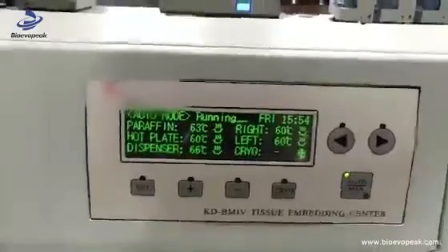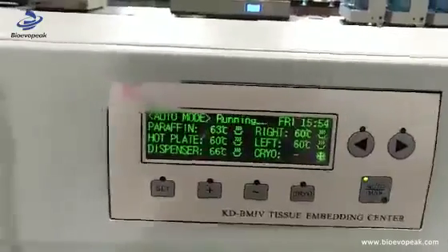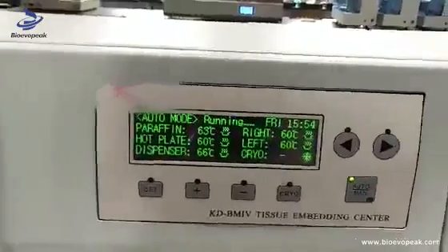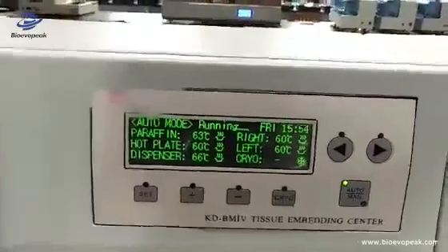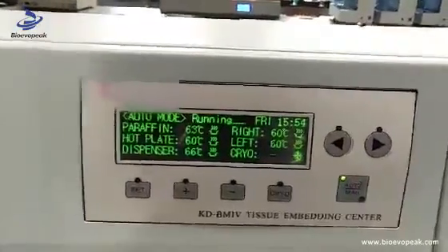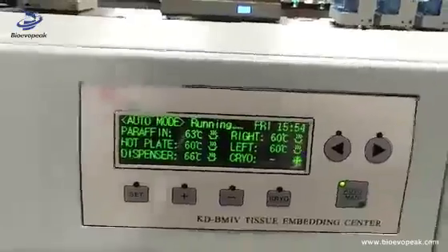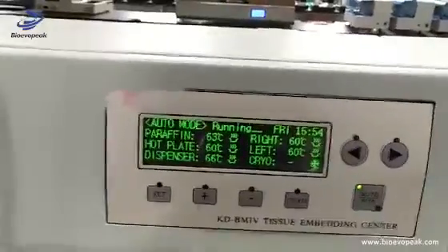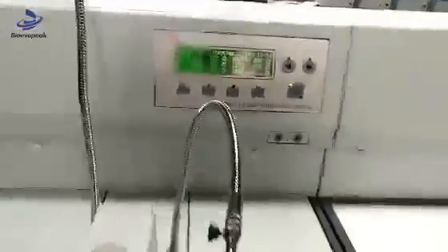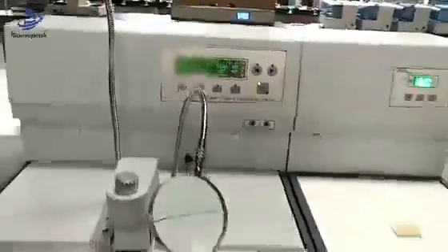When the set time is reached, the machine can work automatically. That's all, thank you.